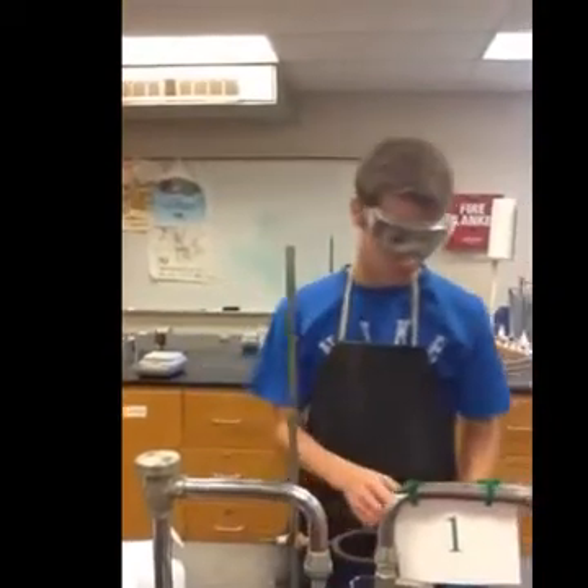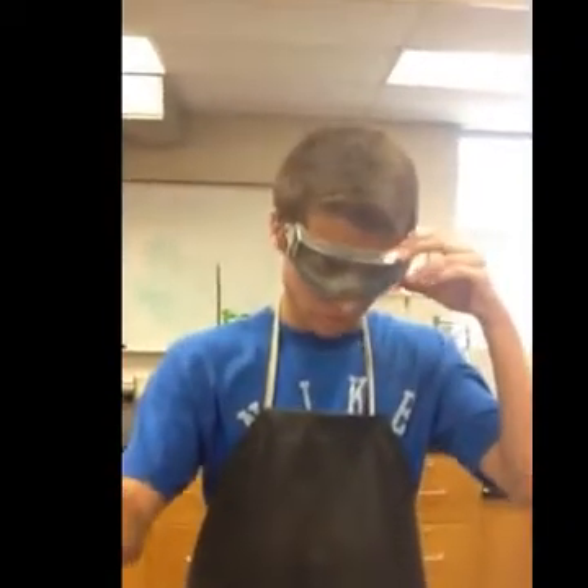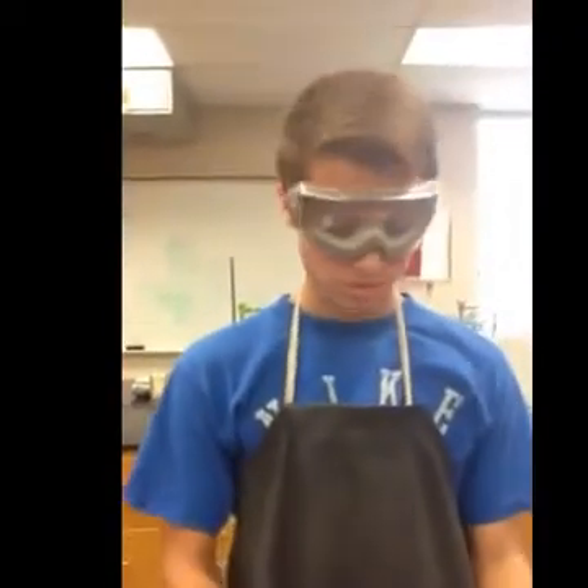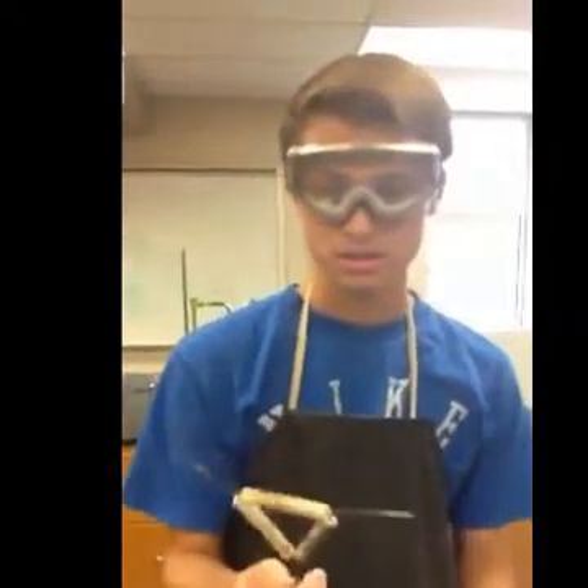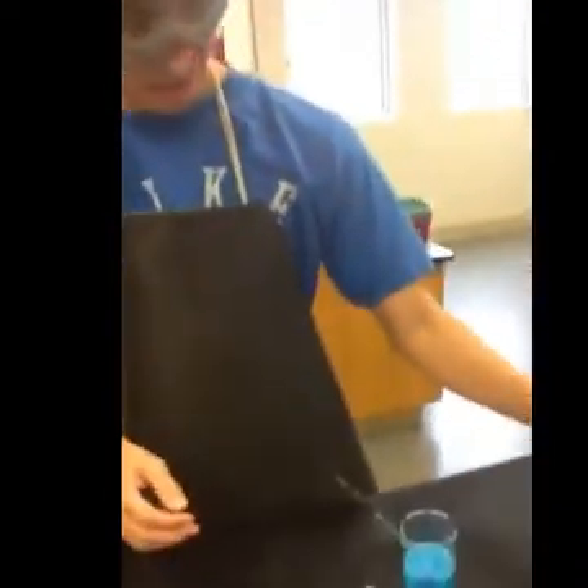So, necessary supplies: you're going to want a ring stand, two beakers — one of them filled with the mixture — a clay triangle, some filter paper, a funnel of course, and some distilled water.